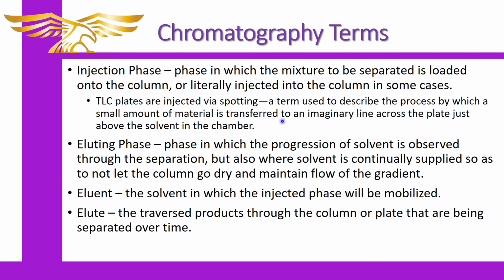We just won't refer to it that way. We'll call it spotting the TLC plate. That's what everybody says. And we'll discuss a procedure later and show some demonstrations of how that's done more adequately.